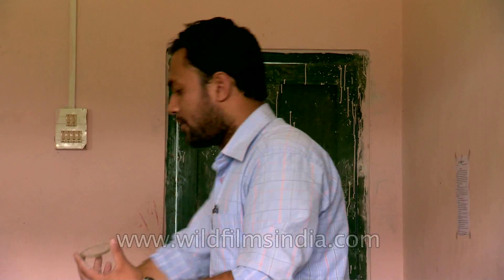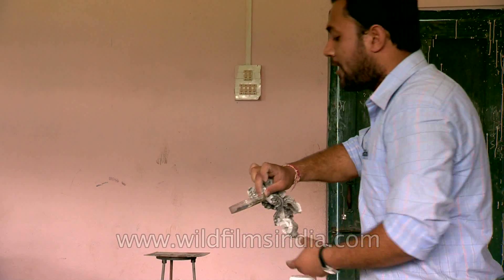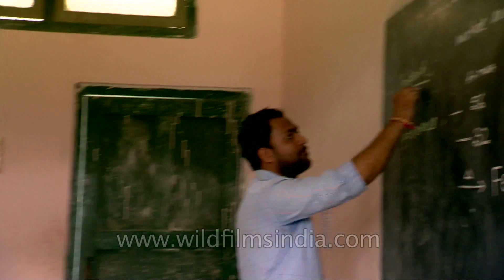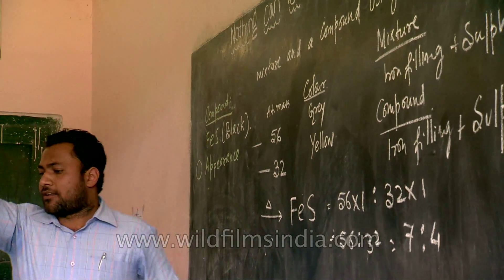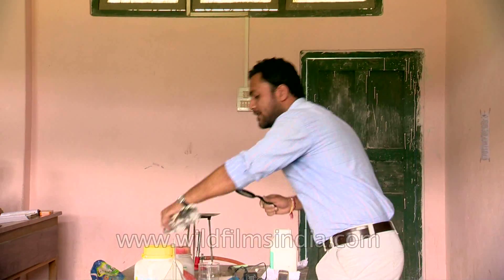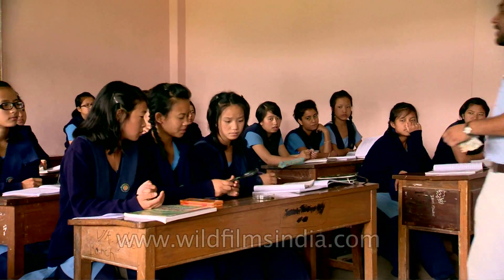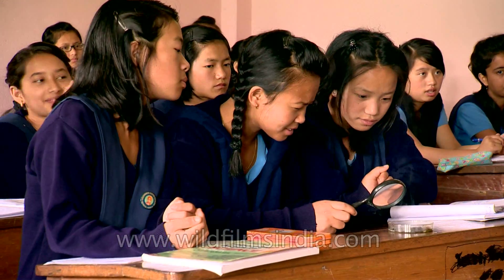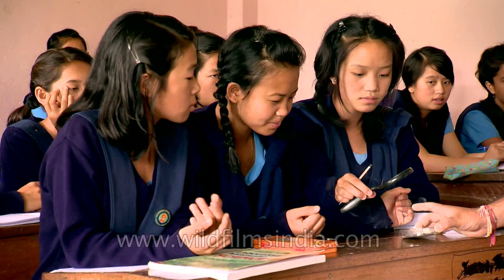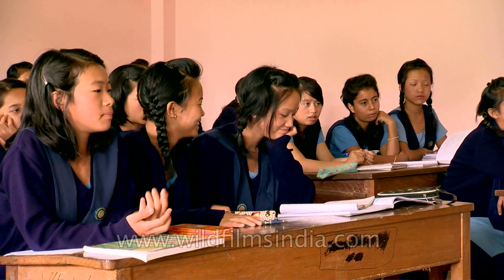Now this is the compound — iron sulfide — which we prepared by heating the mixture of iron and sulfur. What is the color of iron sulfide? It is black in color. Now if I take the magnifying glass and a student looks through it at the iron sulfide, can they distinguish which part is iron and which is sulfur? No — we are not able to distinguish them.